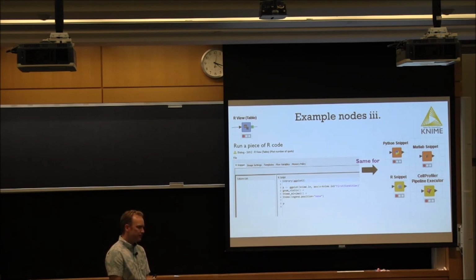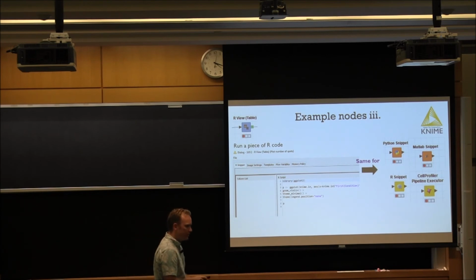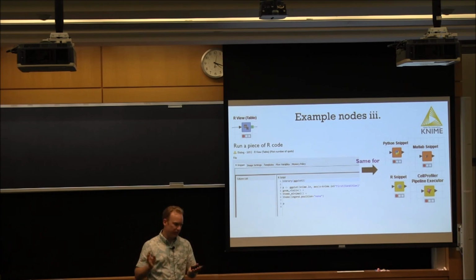Absolutely. So there are video viewers, but also anything that you could do in ImageJ, you can also do here. I've done particle tracking. I've, for instance, uploaded videos where I have spots moving, then I can call the functions for TrackMate in ImageJ. Then I can track my spots through KNIME, and do it in an interactive way to select trajectories. So there's lots of flexibility.